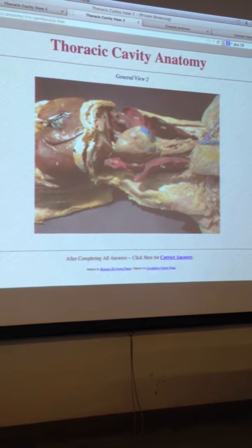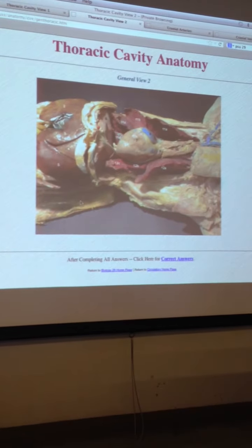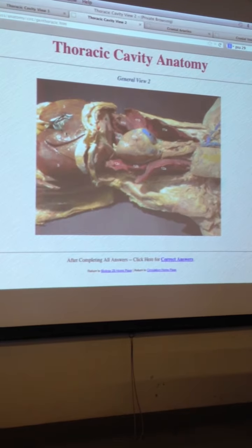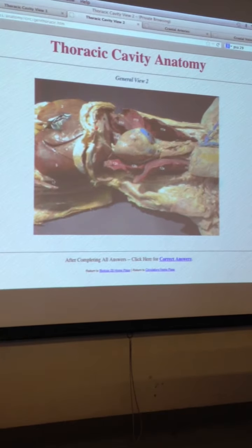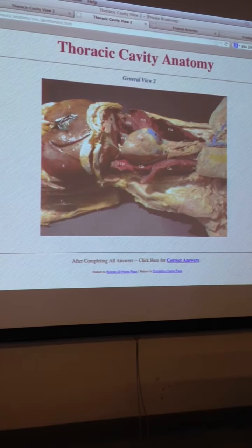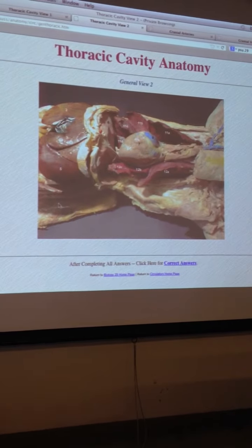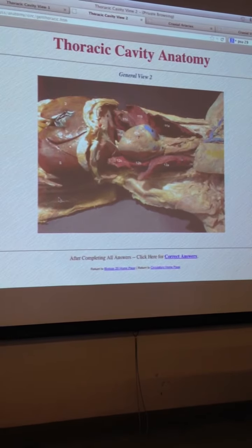So the layers in the abdominal cavity are going to be identified similar to how we identified the pleural membranes. So if we were to put a pin on the actual organ surface, that would be visceral peritoneum. So it's just the membrane covering each organ itself. For the parietal peritoneum, we'd again pin the inside of the abdominal wall. So you put a pin right here where you can see that glossy membrane covering it. And for either of these, again, we'd be asking for the layer. Okay, so if we're asking for any of the parietal or visceral membranes, we're going to be specifying this by asking you to identify the layer.